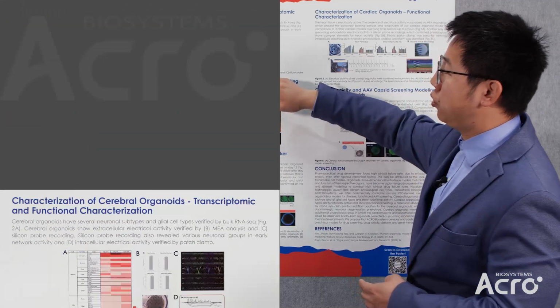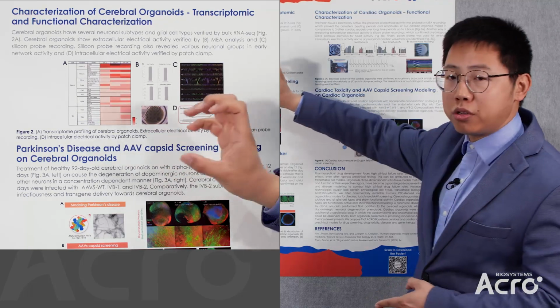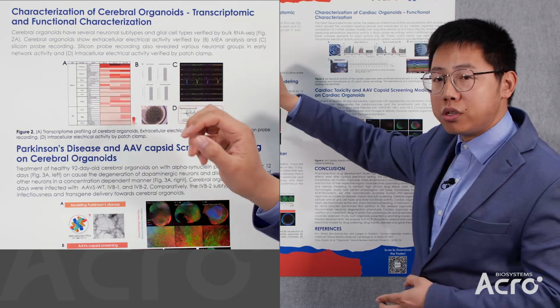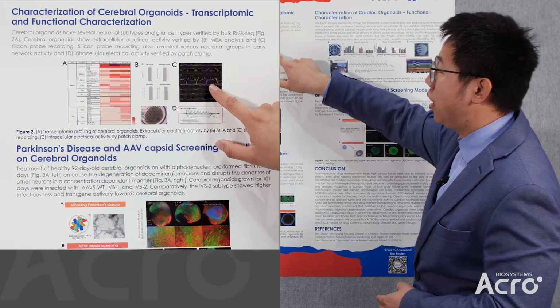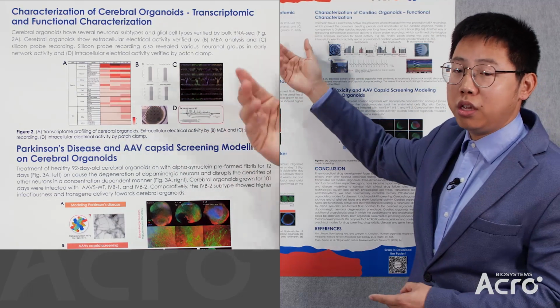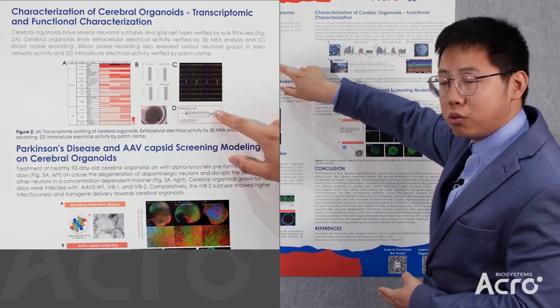Here I want to show you this data. There are different probes or channels that traverse the whole cerebral organoid. These probes can receive the electrical response from the organoids and generate the features listed here. This is very similar to real clinical diagnostics using EEG features. You can see the peaks upside down from the different channels and different response waves.